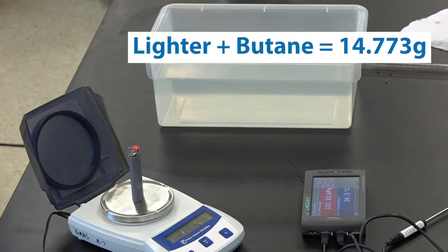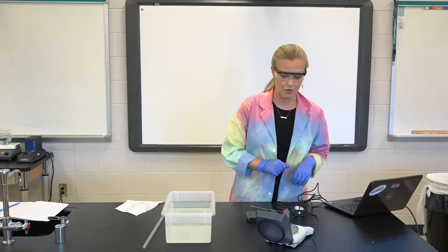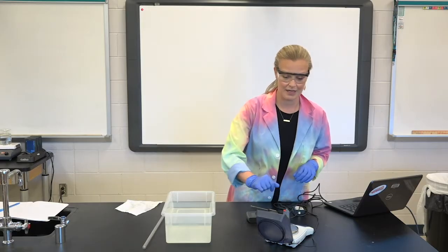14.773 grams is what we're going to record for our mass of our butane lighter at the beginning of this lab.